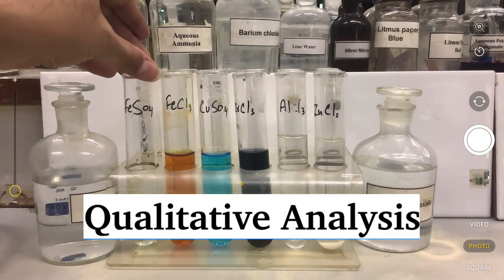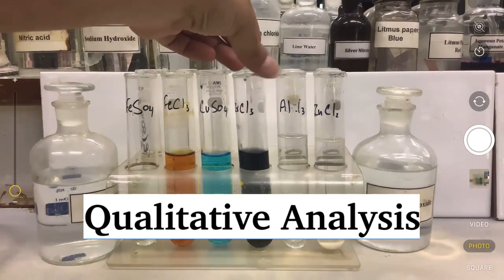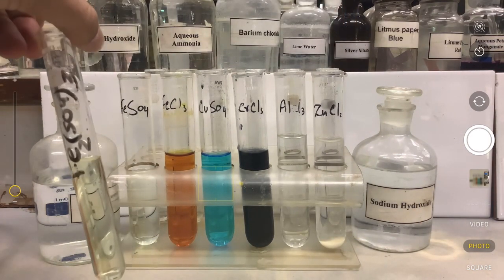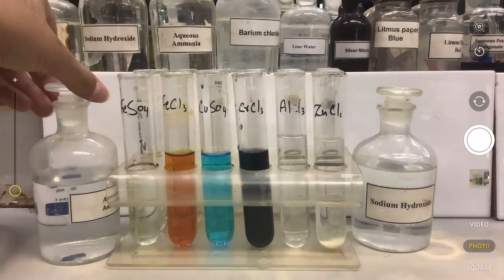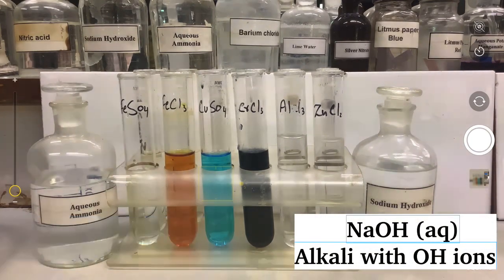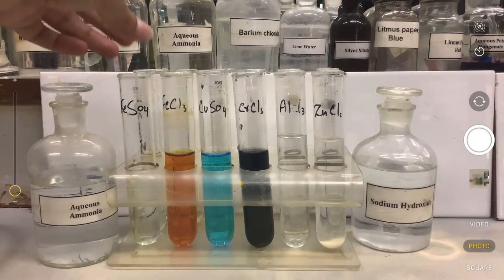In today's video, we are going to be performing qualitative analysis on various salts, and we're going to see the observations and their equations. I have salts of iron 2, iron 3, copper 2, chromium 3, aluminium, and zinc. In order to identify them, I have aqueous ammonia, which is an alkaline solution, and sodium hydroxide, which is again an alkaline solution containing OH minus ions.